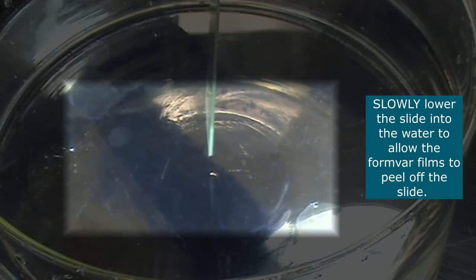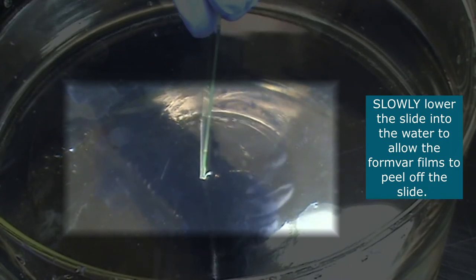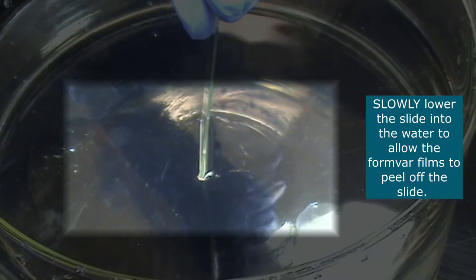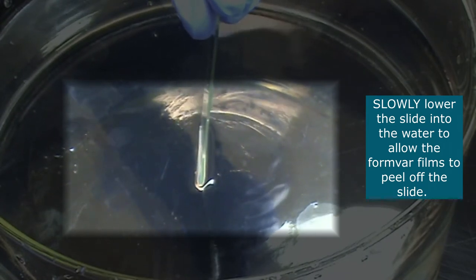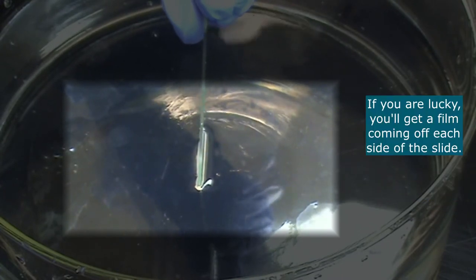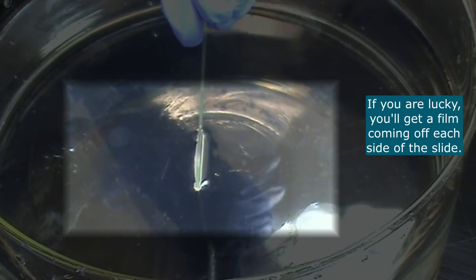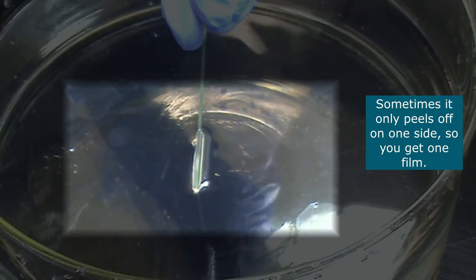Gently lower the slide onto the water to allow the films to peel out of the slide. If you're lucky, you'll get a film from both sides of the slide. Sometimes you can only get one film and the other one gets stuck.